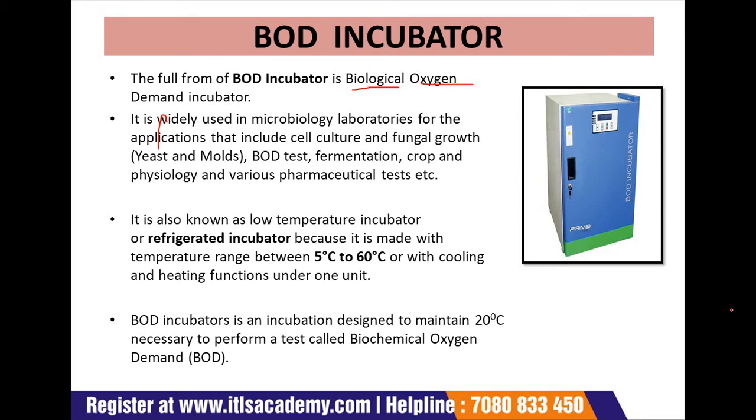It is widely used in microbiology laboratories for applications that incubate cell culture and fungal growth like yeast and molds, BOD tests, fermentation, crop physiology, and various pharmaceutical tests.